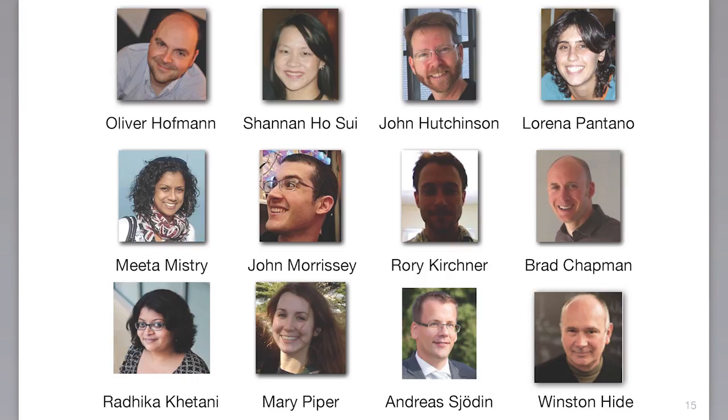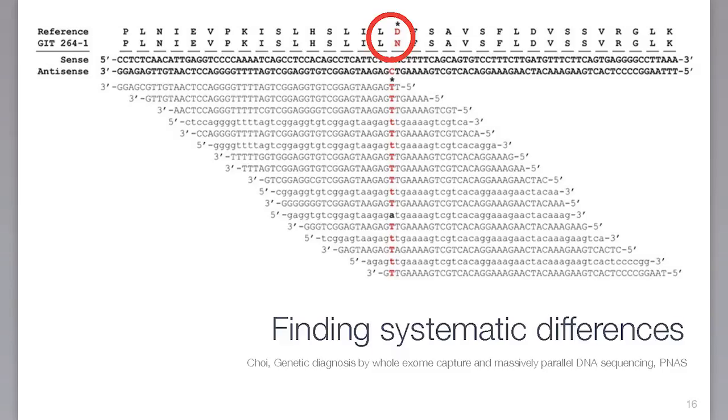For the past 10 years? 10 years. Jesus, okay. So first, I worked with Win, who's going to be the next speaker. I worked for Win first in Cape Town, then in Boston, and with this merry band of people. And for that time, we more and more focused on the sequencing side of things. And for the remainder of this talk, I'm mostly going to focus on projects where we are trying to find systematic differences in samples, differences, SNPs, variation on the genome, ideally that have some sort of functional impact. That means finding letters in an alphabet where your reads that you generate from a sequencer differ from your reference, really.